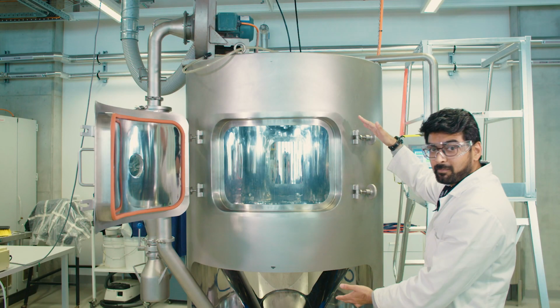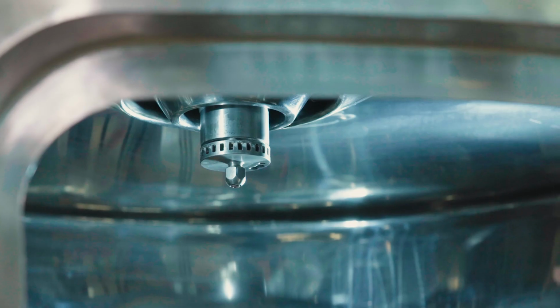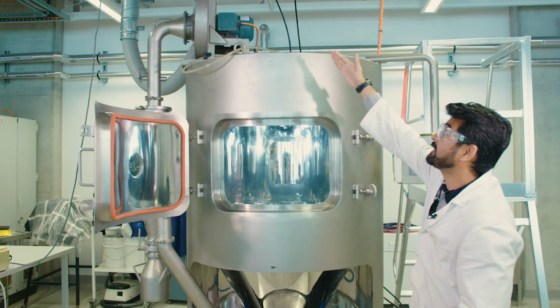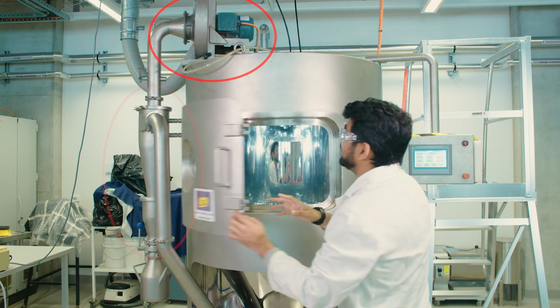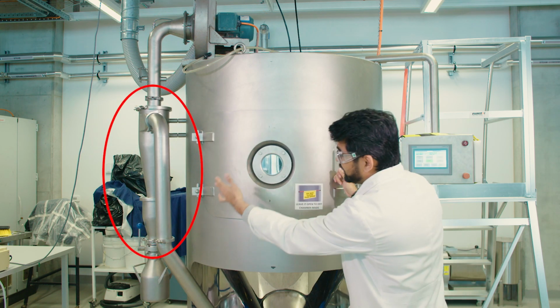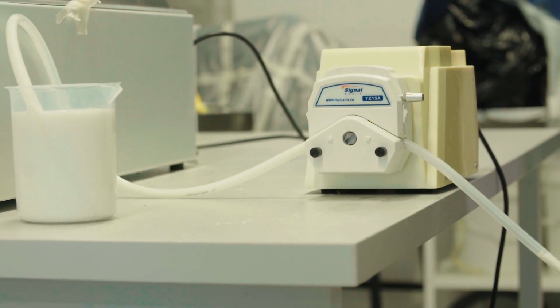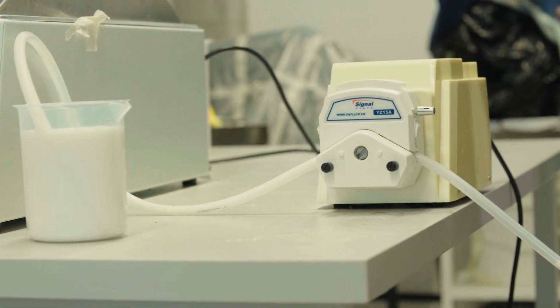It has a drying chamber. At the top of the drying chamber inside, you can see an atomizer, which is the centrifugal atomizer. On the top of the dryer you can see the exhaust system. Connected to the exhaust system is the cyclone, which is later connected to the collector where all the powder gets collected.